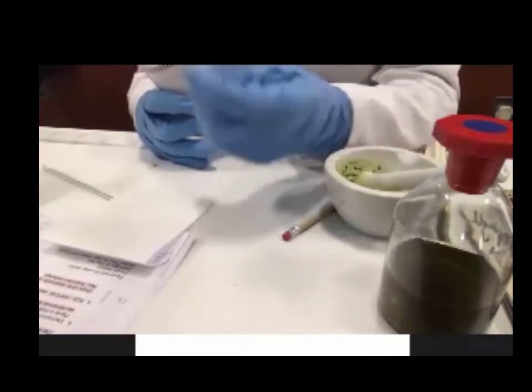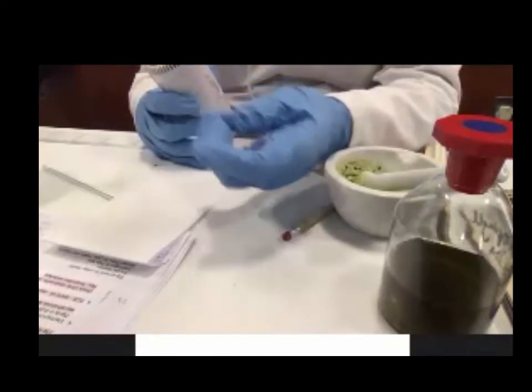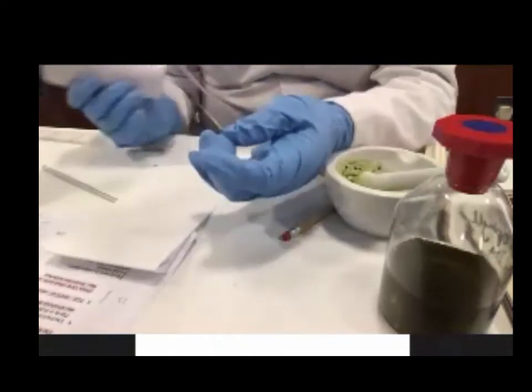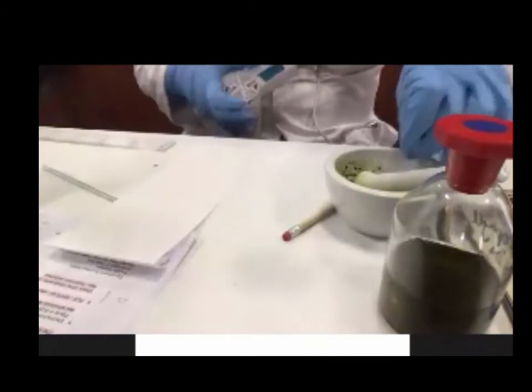So, a few tips. If you use ordinary filter paper, what happens is that you make a hole in it really easily. It can't tolerate this kind of treatment. Chromatography paper has a different structure to it. Okay, so the idea then is to get a green spot, usually on the X. So the more you do, the better the result.